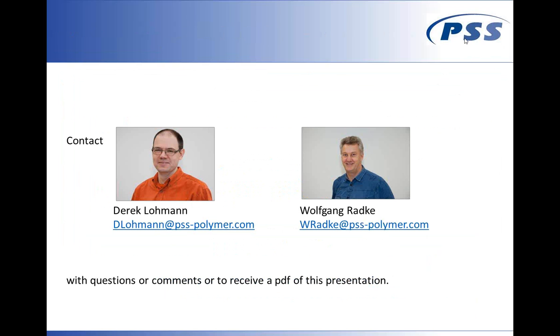If you go to chloroform or toluene, you will not see your high molar mass PMMAs anymore. It will stick forever on the column. And actually what you have to do now is play around with the composition of your strong solvent, in which your polymer makes size exclusion, I have to say, and with the amount of the weak eluent, which gives rise to adsorption.